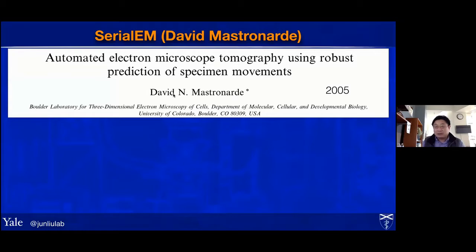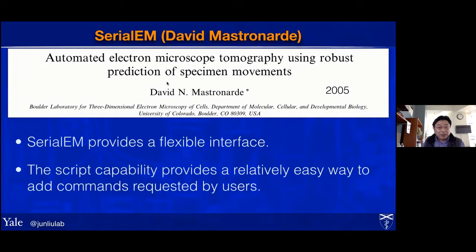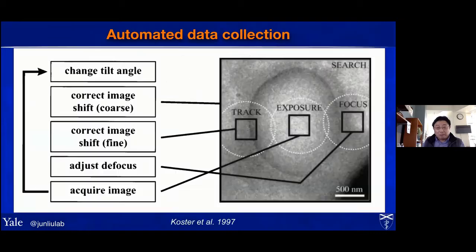For us doing a lot of tomography, based on what I know, most people use SerialEM, developed by David Mastronarde many years ago. This package became very powerful and flexible, as we mentioned earlier today. It gives us a really nice platform for data acquisition, particularly for tomography, but also for single particle. As I mentioned earlier, this is the normal overall flow.